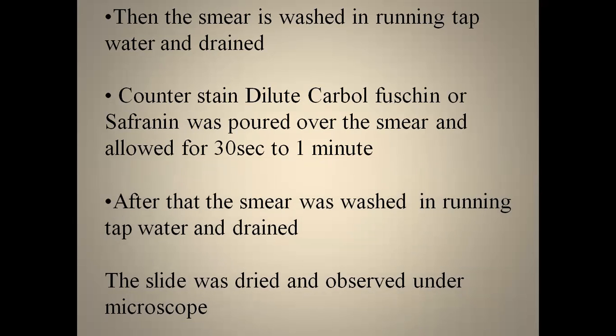Then counterstain with dilute carbol fuchsin. You have to add the counterstain, which is also called the secondary stain, dilute carbol fuchsin or safranin. It is poured over the smear and allowed to react for 30 seconds to 1 minute.